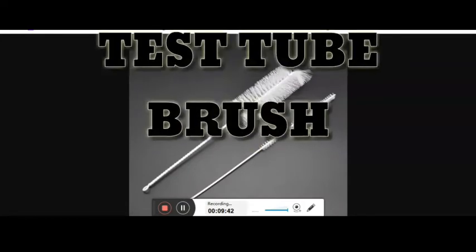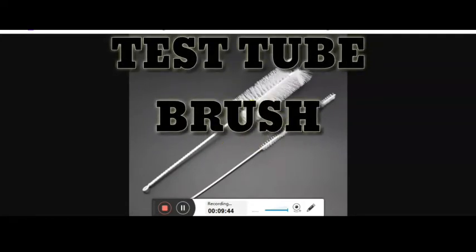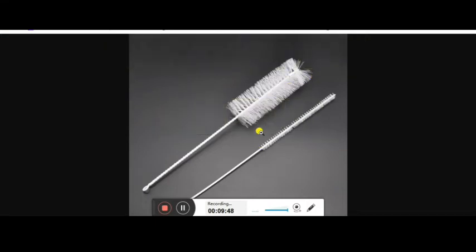This one is the test tube brush. As the shape shows, it is used for the cleaning of the test tubes.